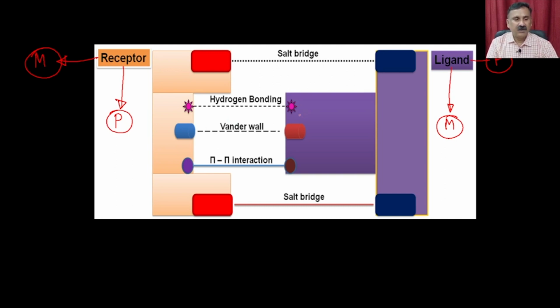the proteins. So this is all about affinity chromatography, and very briefly we have discussed how two mutually exclusive parameters can be used to purify proteins with the help of affinity chromatography. In our subsequent lecture, we are going to discuss how you can generate the receptor or the ligand, and how you can perform affinity chromatography. With this, I would like to conclude my lecture here. Thank you.